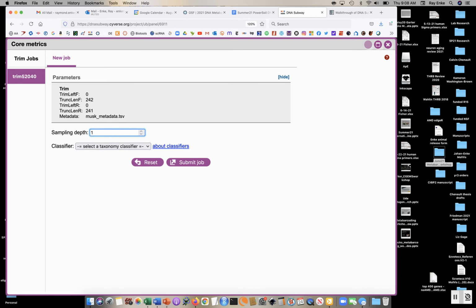We can set this to a higher number, say 1,000. Then Purple Line will factor in 1,000 features per sample, but that's going to cut out all of your samples that have less. So this is where you may want to branch off and do several different types of analyses. Maybe you have enough features in your samples that this isn't an issue.